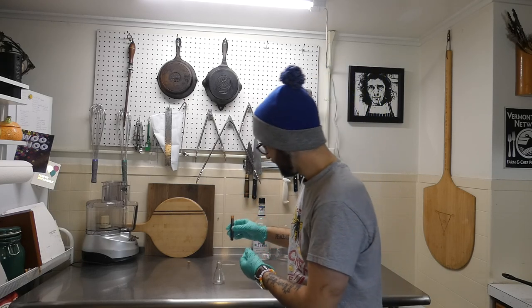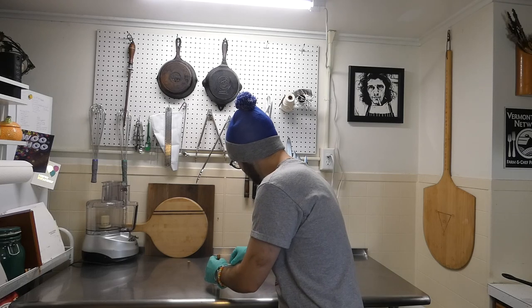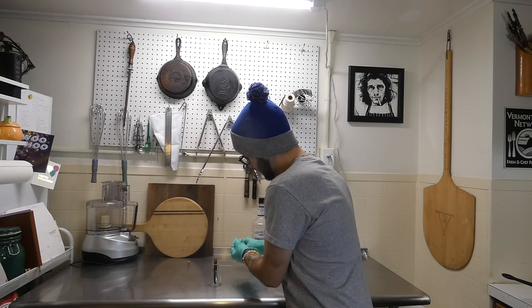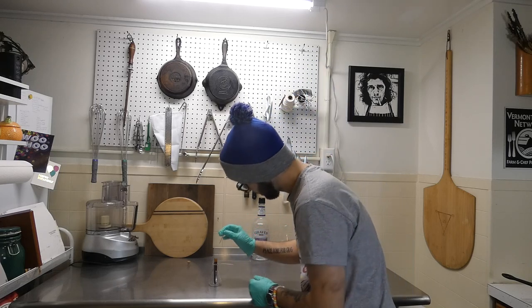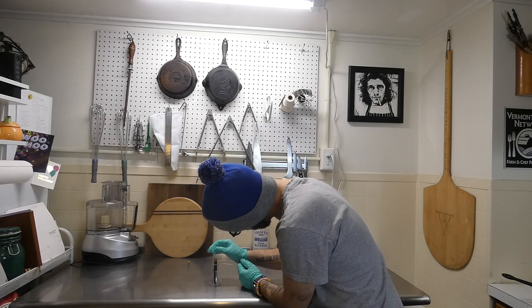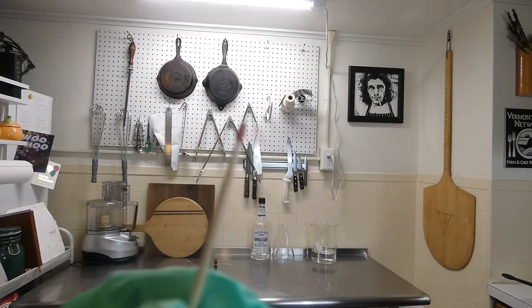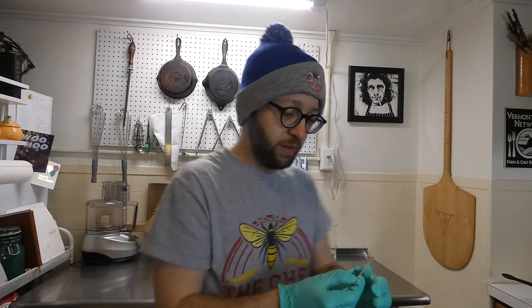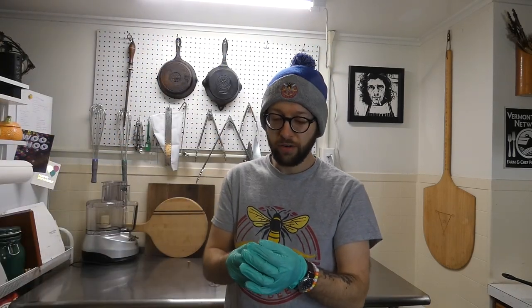I'll let you know if that ends up happening. But anyway, let's give this a try. So, I have a toothpick here, and I'm just gonna dip it right in, just a little tiny bit. Literally, that's probably too much. I'm not sure if you can see it. Yeah, that's quite a lot, but we're gonna roll with it anyway. All right, here we go.